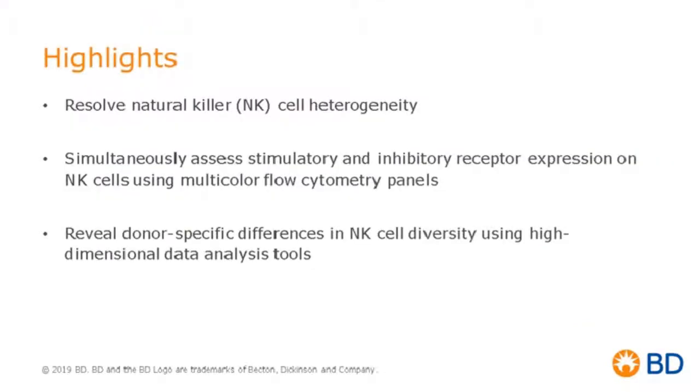I'm particularly excited to talk to you today about multicolor flow cytometry applications that we have developed for the study of heterogeneous natural killer cells. As highlights of what we will talk about today, at a high level, we are going to talk about the resolution of natural killer cell heterogeneity and how we achieve this through multicolor flow cytometry analysis by simultaneously assessing stimulatory and inhibitory receptor expression on NK cells. And at the end of the talk, we also look into advanced high-dimensional data analysis tools that can enable the identification of differences from donor to donor when it comes to the NK cell repertoire.